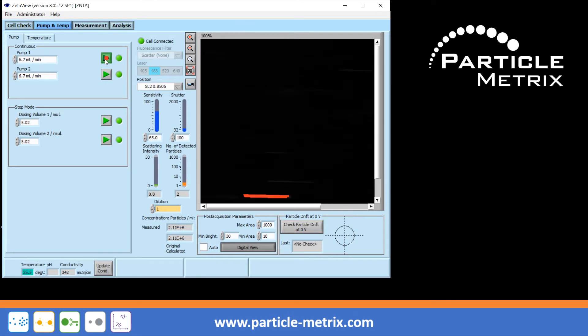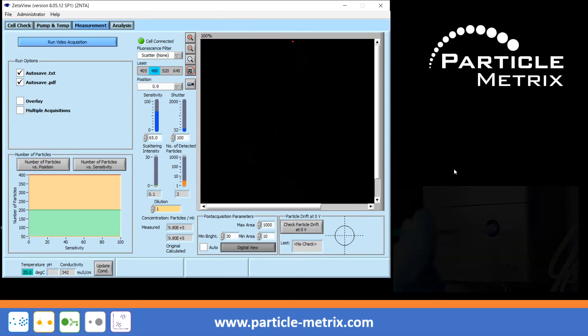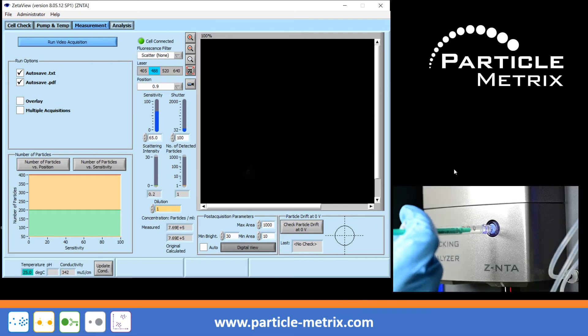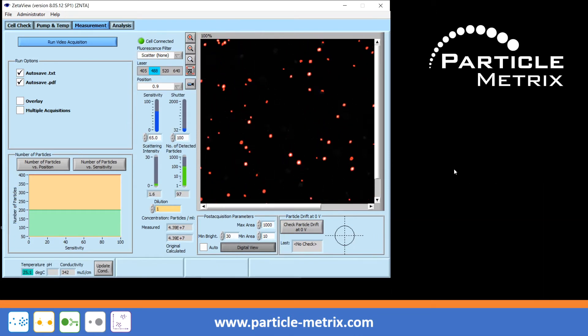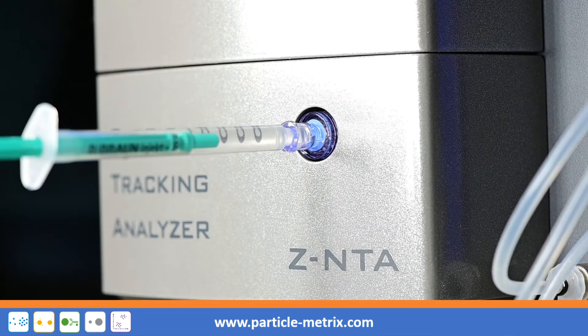If an air bubble appears and the system is already filled with a sample, you can try to inject a little more sample with a short, forceful push from the syringe to move the air bubble away. The prerequisite for this is that the syringe with the sample is still located at the injection port and that there is still some sample volume left in the syringe.